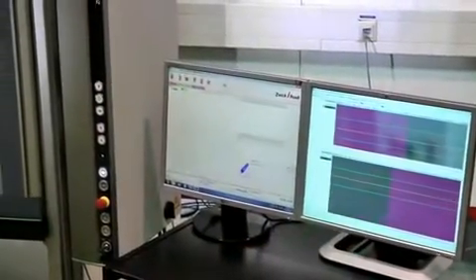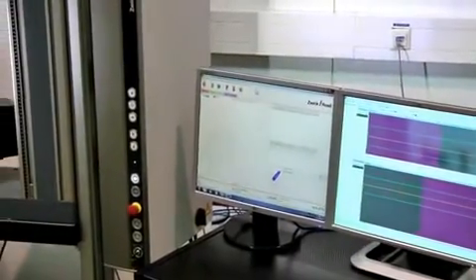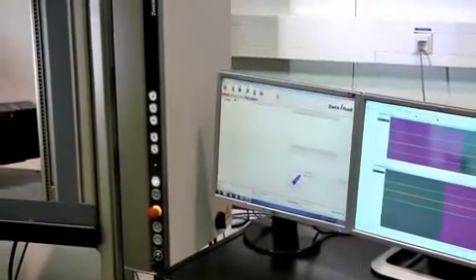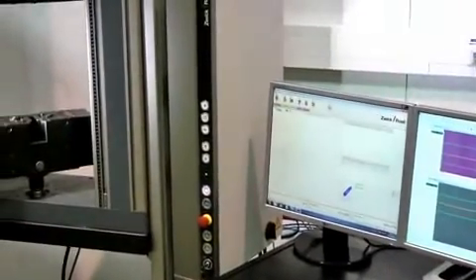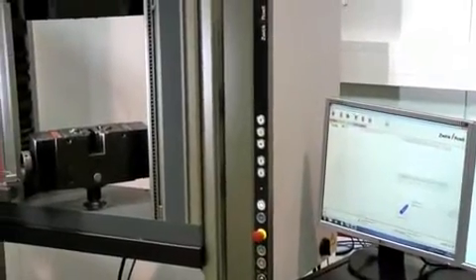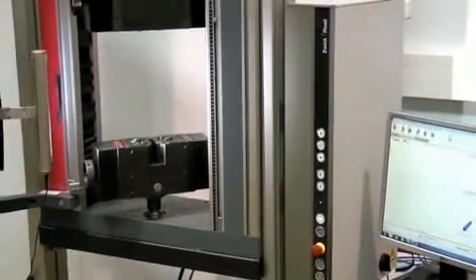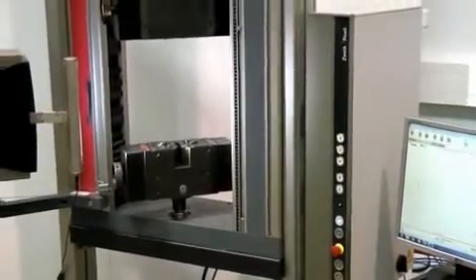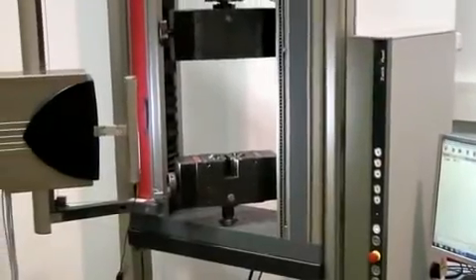Today we are going to use a Z50 machine together with a Video X10 2 camera system which is mounted inside a big case together with a front light.